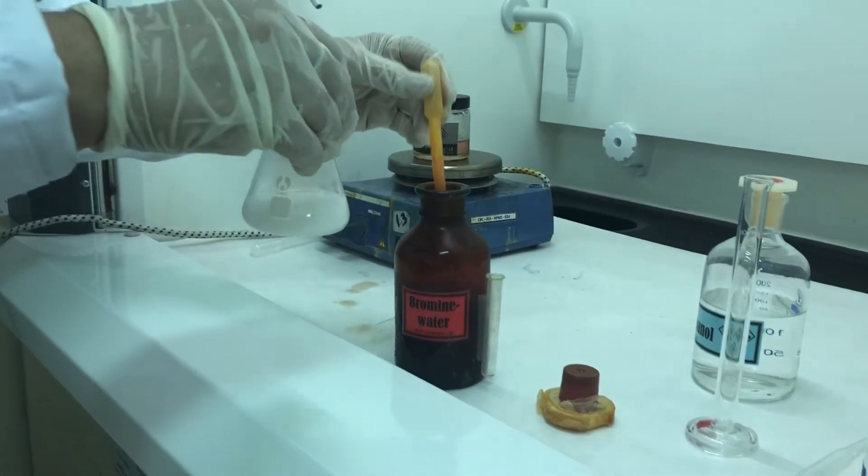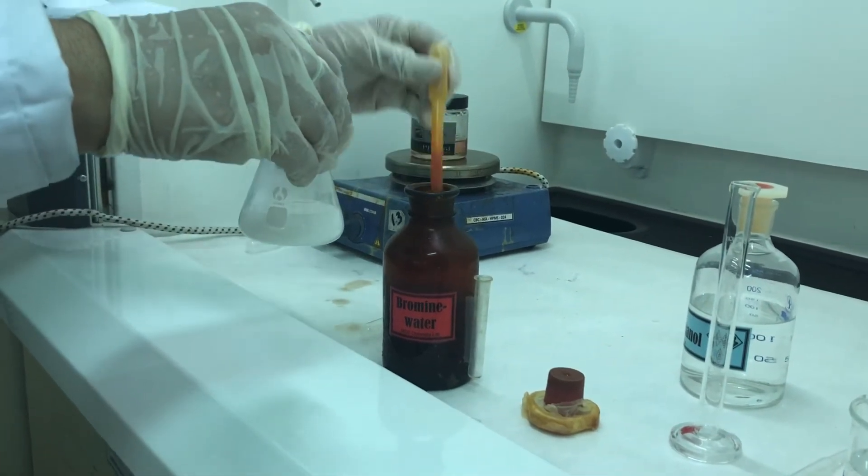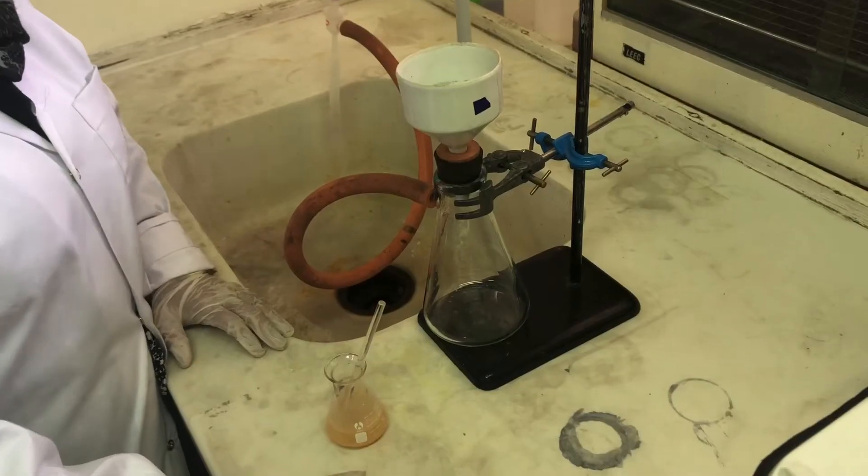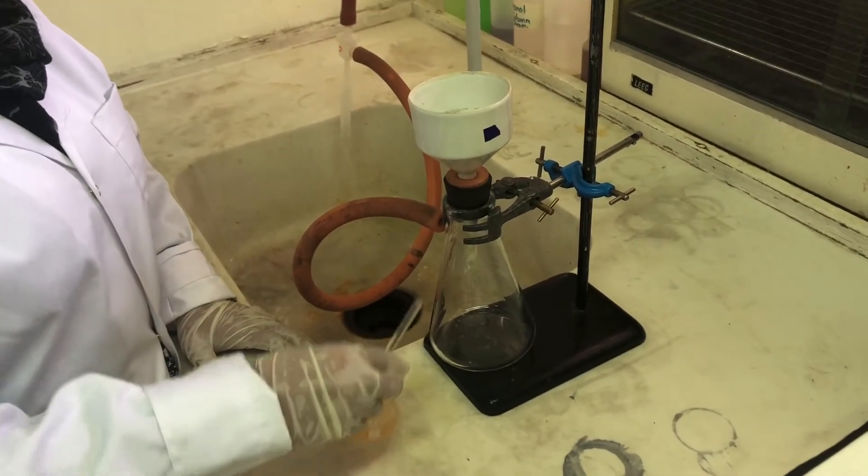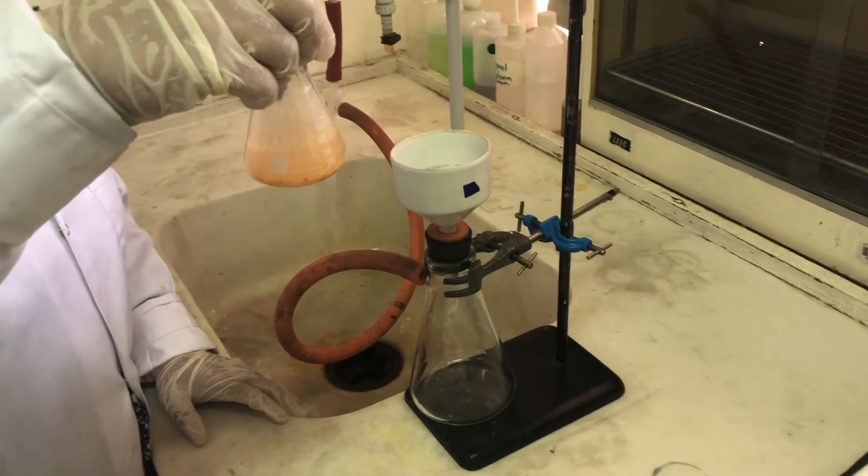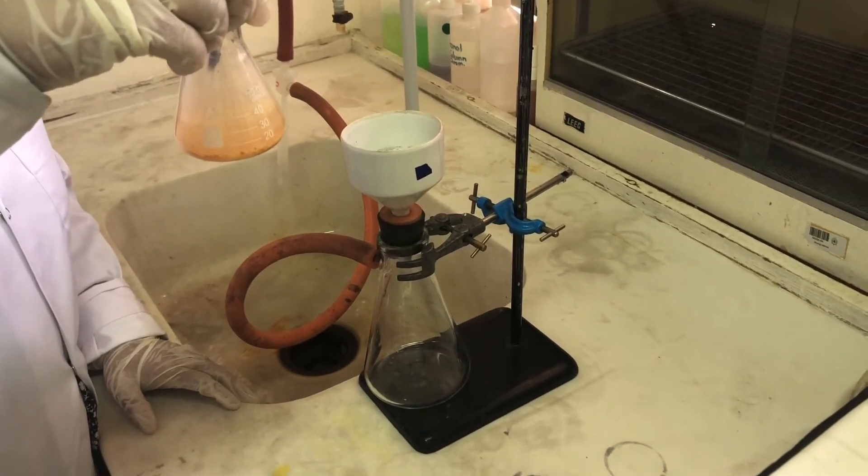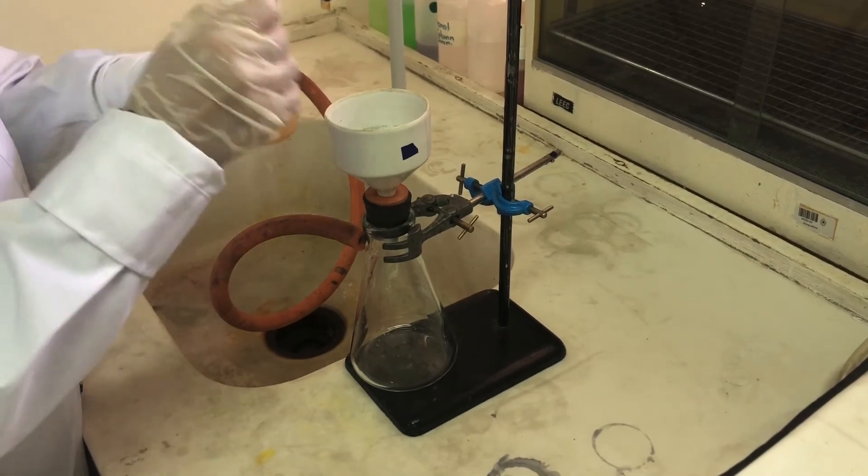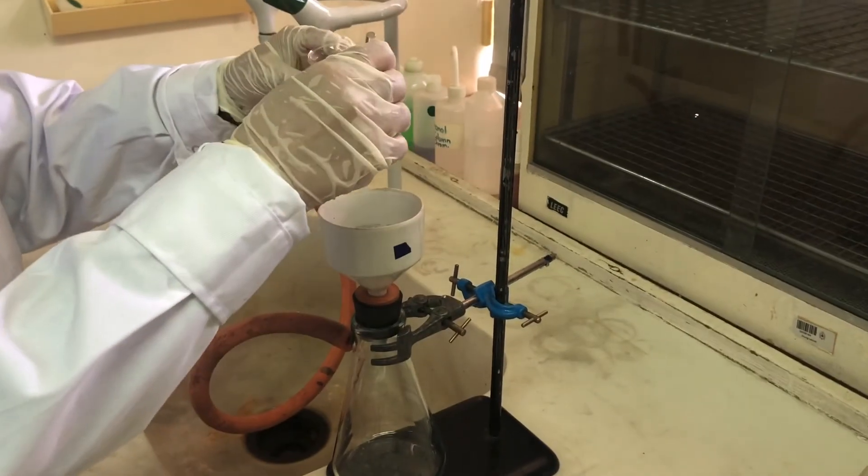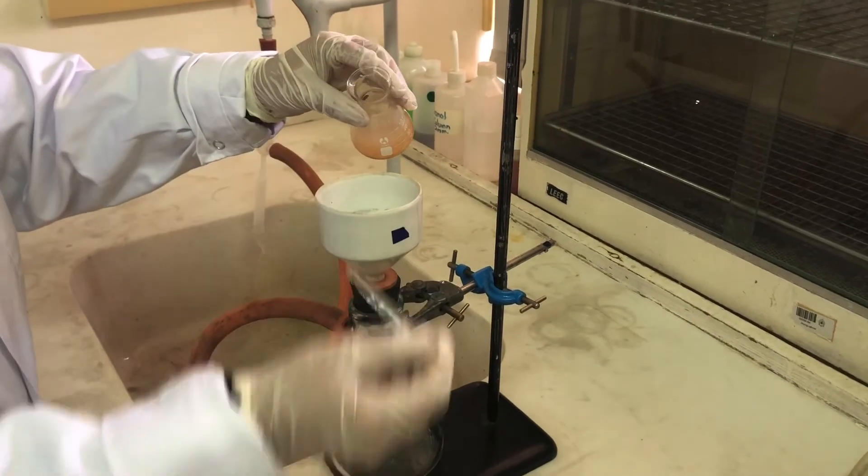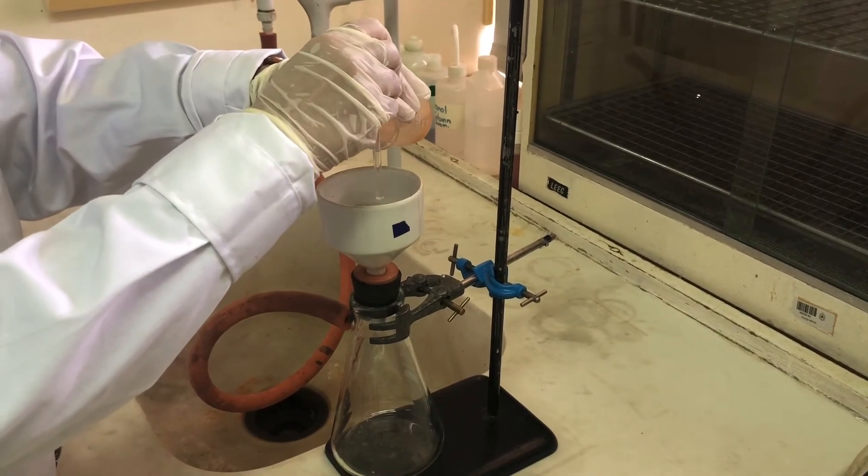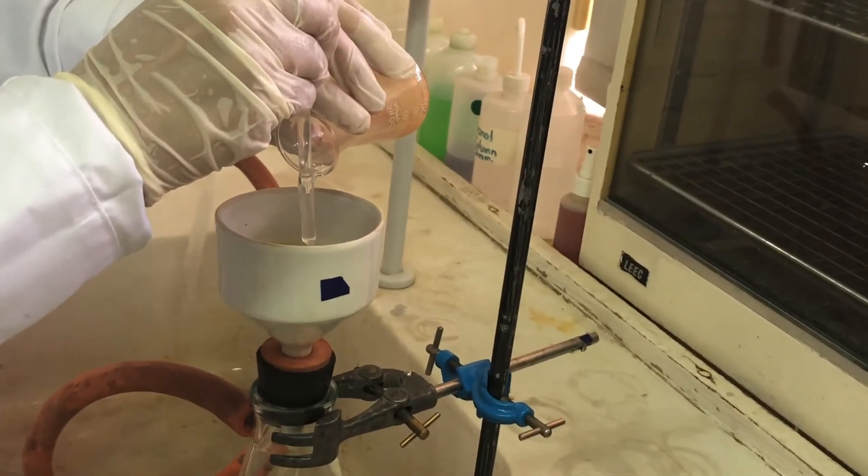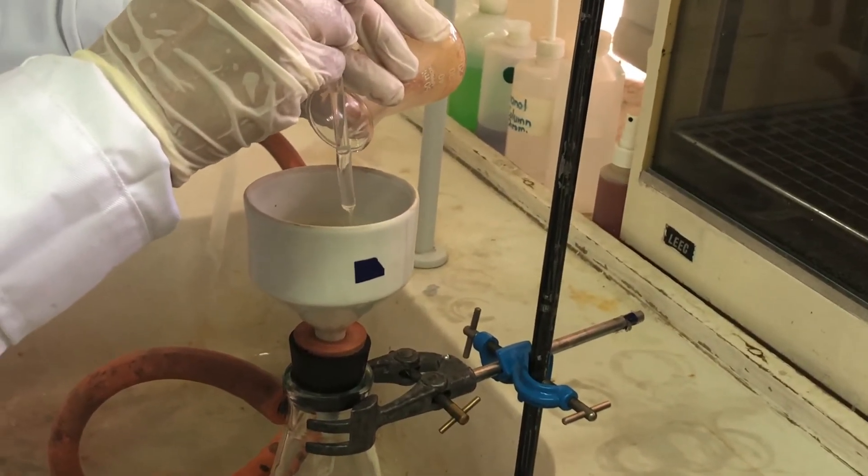So we keep adding till the brown color remains inside the solution. Step 3 we have got the product as you can see, 2,4,6-tribromophenol. We are going to filter this product. As you know how to do the filtration, we are going to do filtration and then washing is needed.